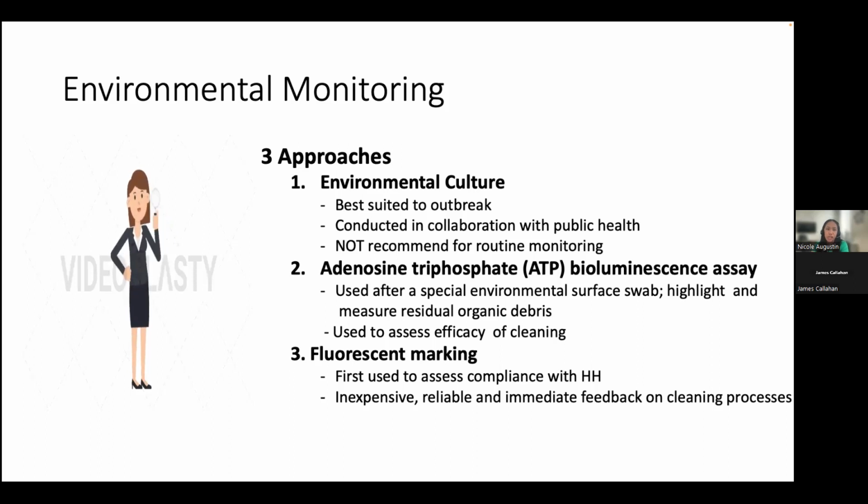Culture, which is best suited for an outbreak. You conduct this in collaboration with public health. It's not recommended for routine monitoring. Environmental culture is when you collect a swab using your general culture swab or agar slide technique.